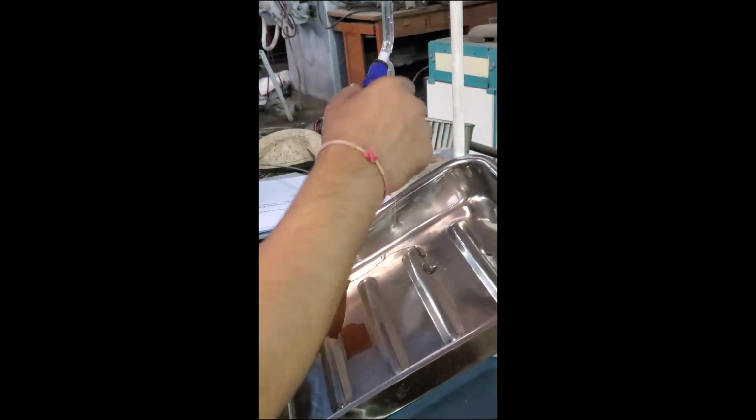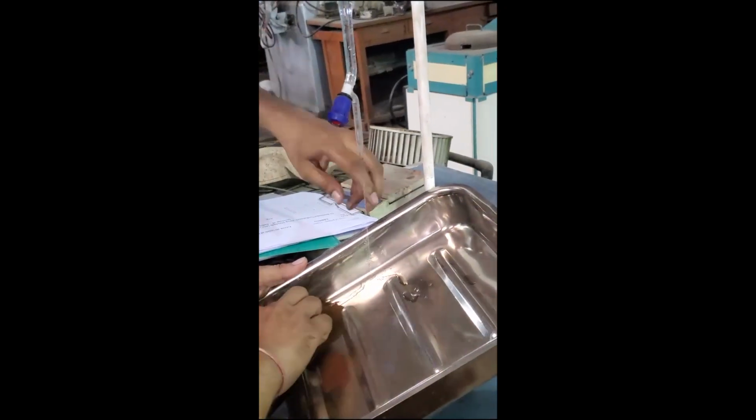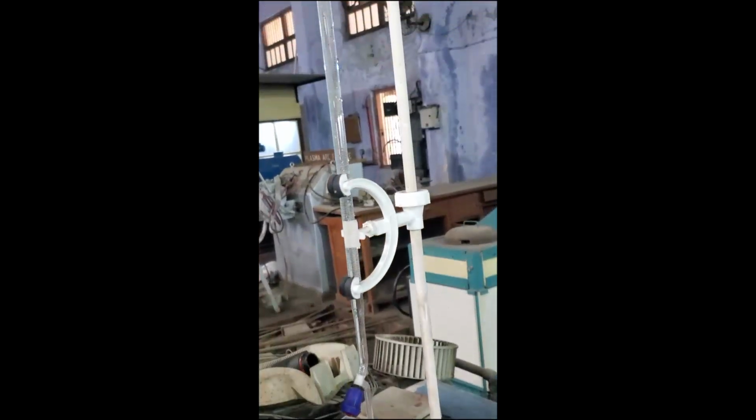Now we are mixing the water of 24 cc from the burette. So we are adding water into the mix of iron ore and bentonite.